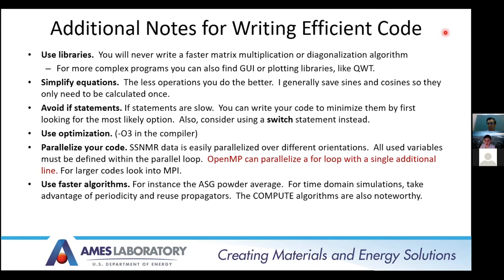The next question is DNP related. They ask, for the simulation of DNP sweep profiles, how many electrons can be included? So the program that I wrote previously, I only coded it in such a way that would accept one or two electrons, but in principle, there's no limit. You can add as many electrons as you want. If you use this Landau-Zener trick that was developed by Kent Thurber, as well as Fred Mentink-Vigier somewhat simultaneously, the electrons add very little to the calculation of the DNP enhancements, and so you can add as many as you want, and there's virtually no cost.